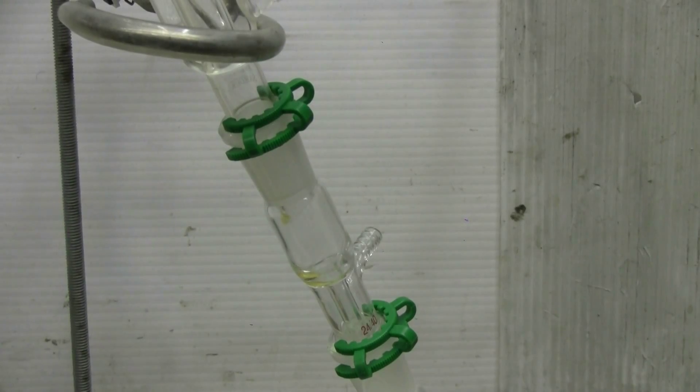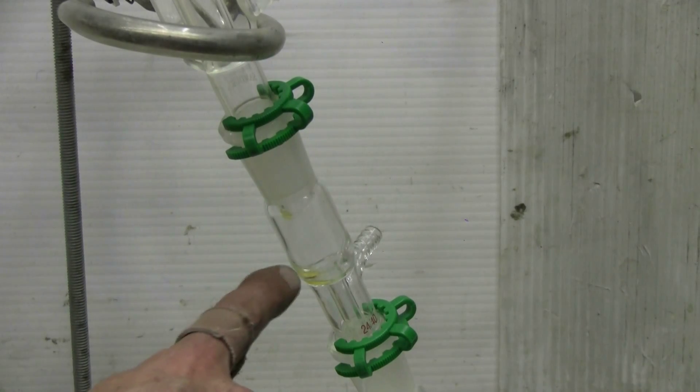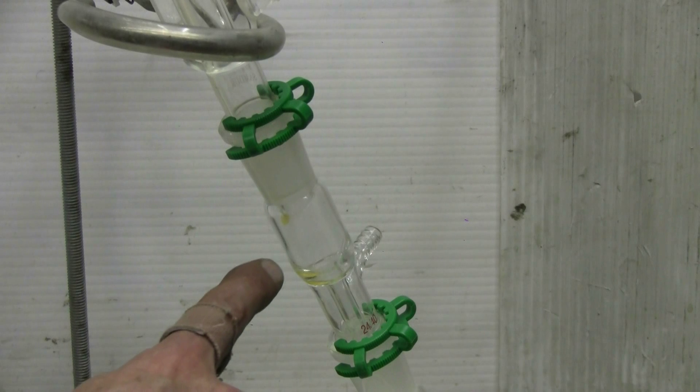We can see a bit of the initial distillate, it's yellowish in color here, beginning to collect as I continue to keep the propane torch to the reaction vessel.